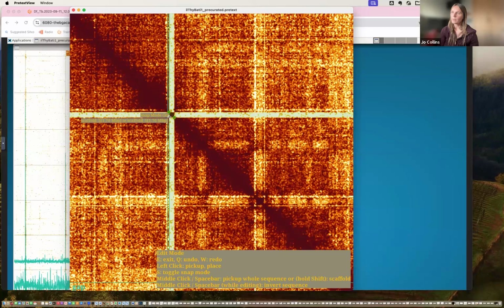So as accurately as we can, to widen or narrow the distance between these green blocks, you slide your mouse up and down on your worktop, and that helps you get your crosshairs to be the right shape, the right distance apart to capture the piece that you want.